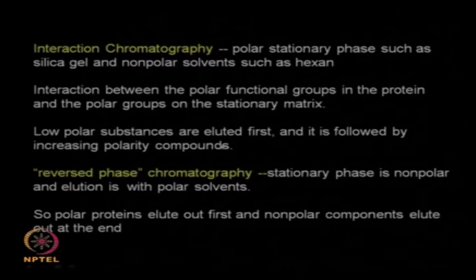So low polar substances are eluted first, followed by increasing polarity. Whereas in the reverse phase or hydrophobic system, the stationary phase is non-polar and the elution is done through a polar solvent. So polar components will elute first, and non-polar components will elute at the end.